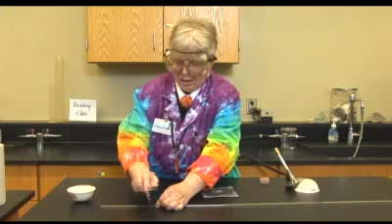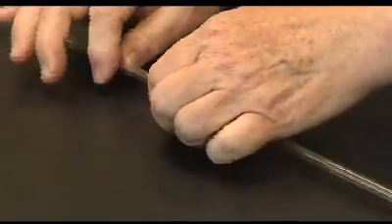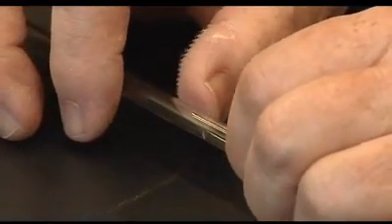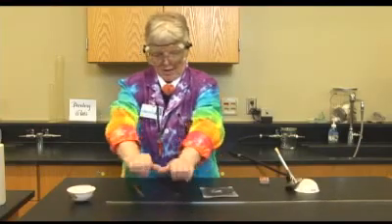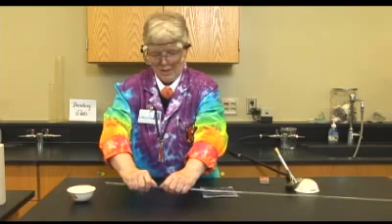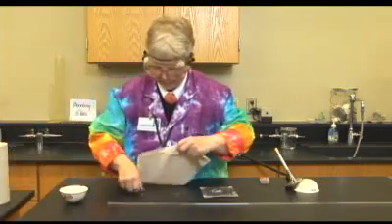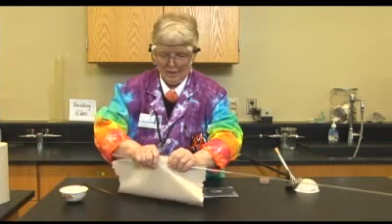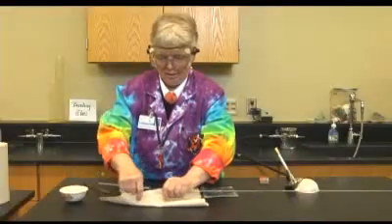I only want to make one cut — you don't want to go back and forth. Just one cut and you should get just a little tiny scratch in the glass. The idea is to put your thumbs behind it and push away. I'm not going to do that without some paper just to protect my hands. So I'm going to put a little piece of paper behind me and then snap it — there we go.